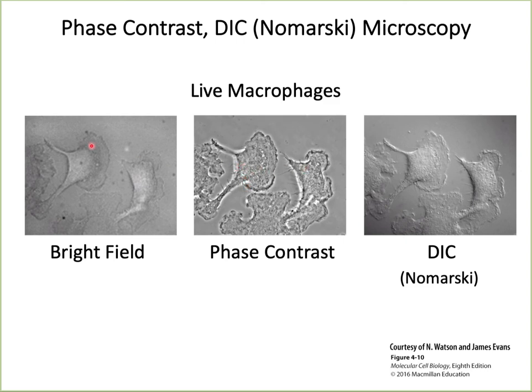See the comparison between the Brightfield versus the phase contrast images. You can appreciate the detail gained by phase contrast microscopy compared to Brightfield microscopy, which capitalizes on the different refractive indices of cellular components and gives greater detail of the organelles.